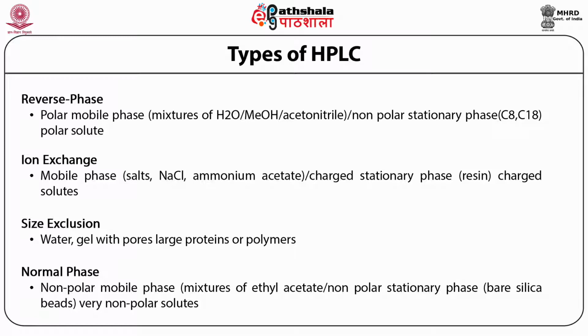The stationary phases are predominantly silica-based but surface modified with non-polar carbon chains like C8 or C18 carbon chains. Sometimes the surface is modified with phenyl rings, so that you get different types of column chemistry.